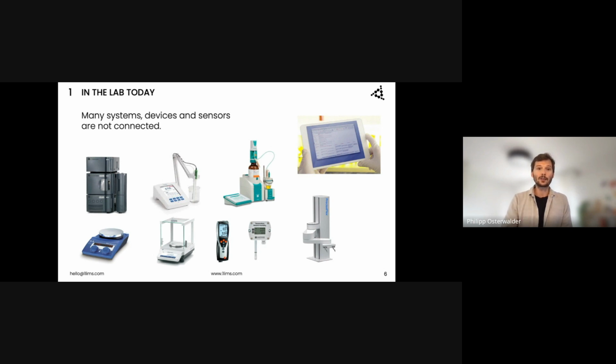It doesn't always make sense to connect all of these devices, but through a cost-efficiency analysis it can be determined which lab devices make sense to connect, to streamline the workflows and to get full automation.